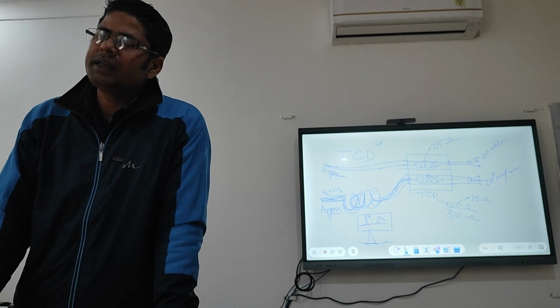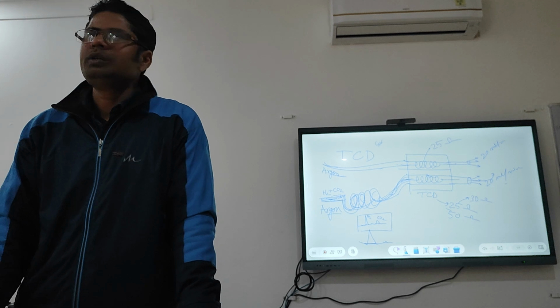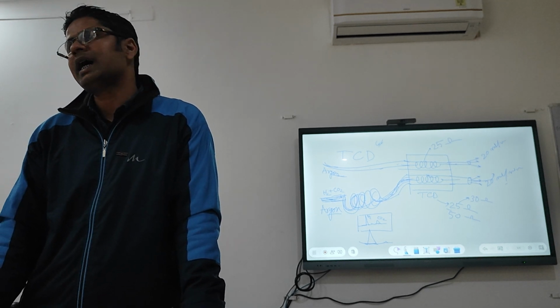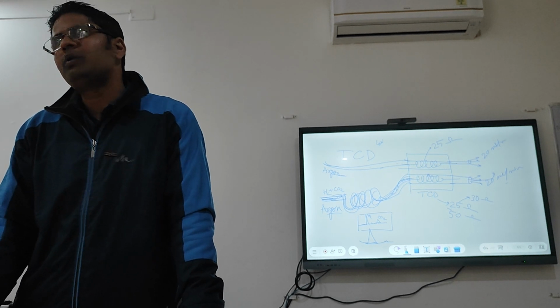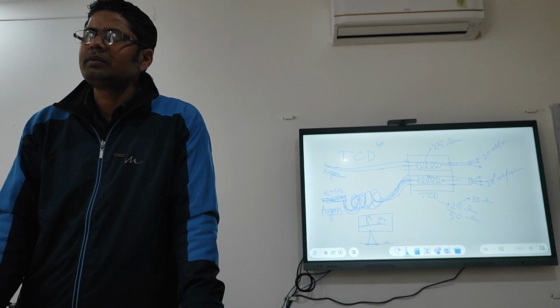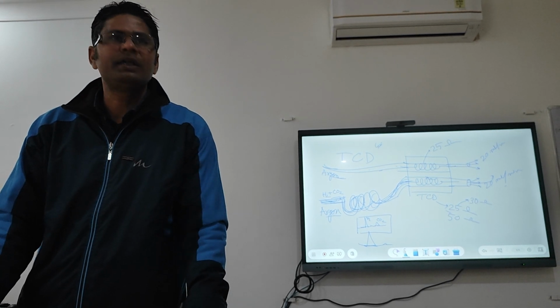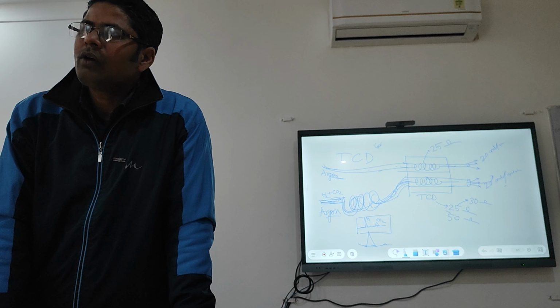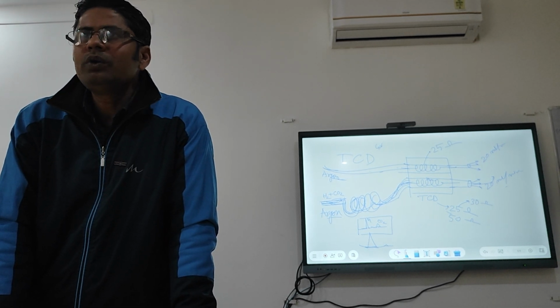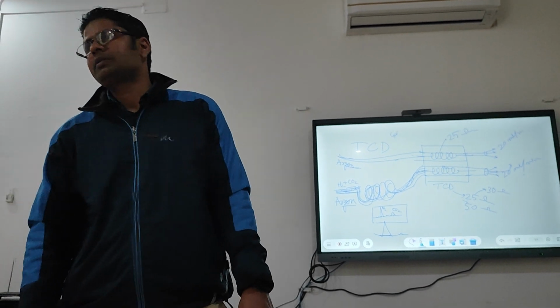So if your sample contains CO and CO2 at ppm level and other gases at percentage level, which detector do you want to use? You have TCD and FID. Some non-hydrocarbons are there, some hydrocarbons also, and CO2 in very small amounts. We want to detect all the components, so we have to use both detectors.